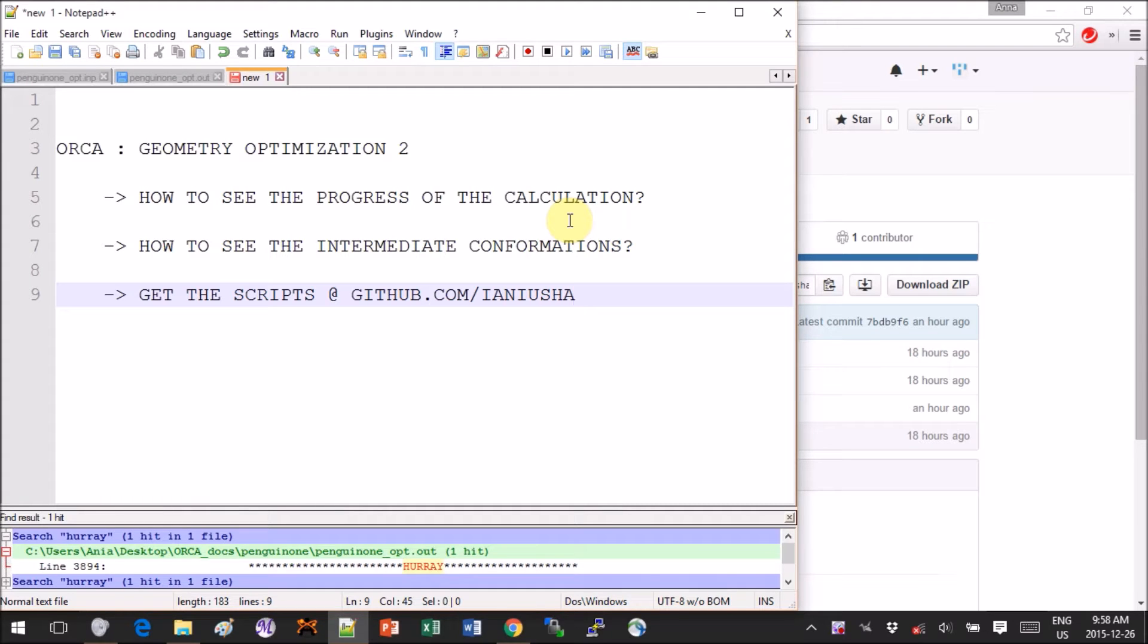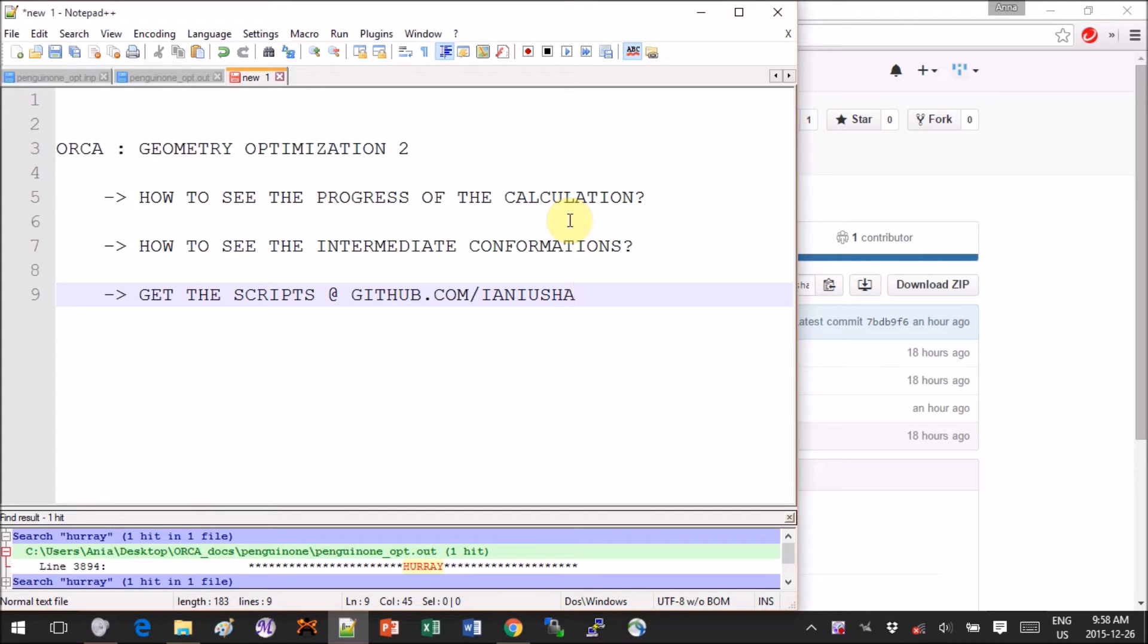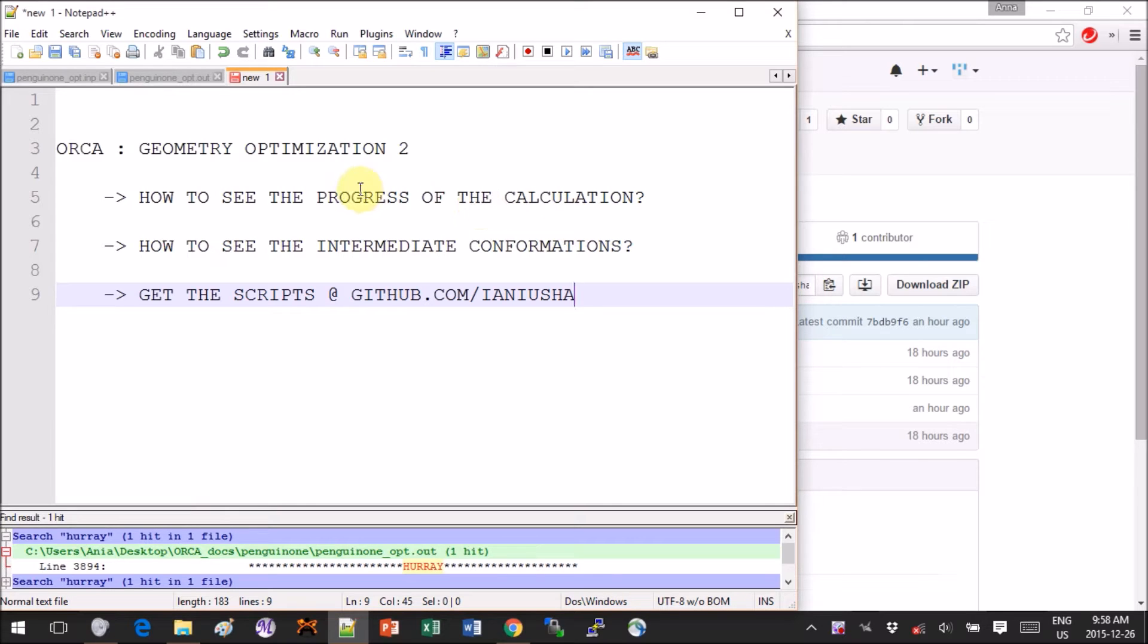Hey guys, this tutorial is on ORCA and we will look at different tricks and things you can do to have a better idea of what's going on during your calculation and also see the different ways of how you can monitor the progression of the calculation even if it's not done yet.